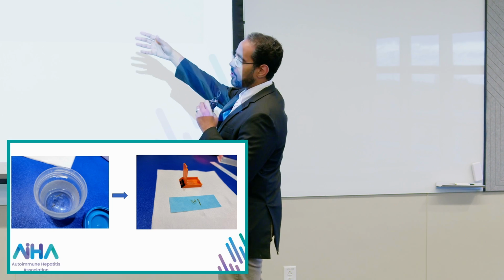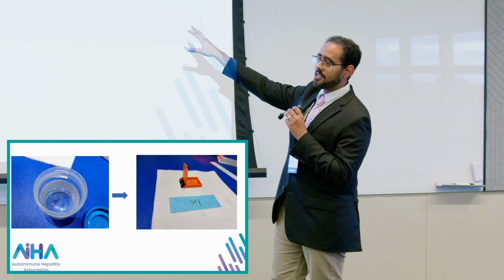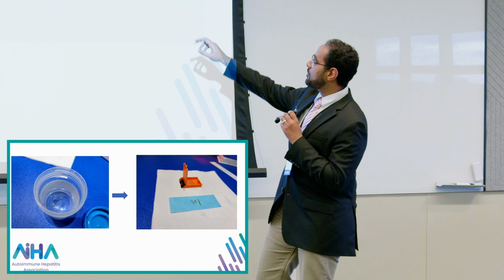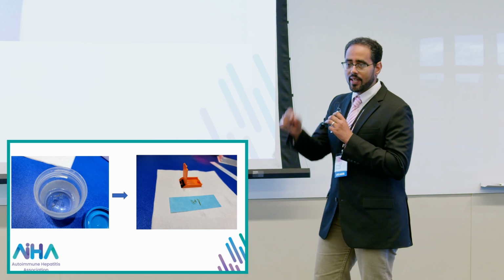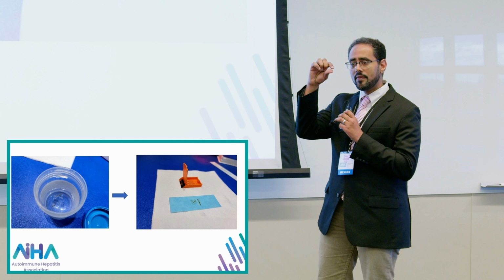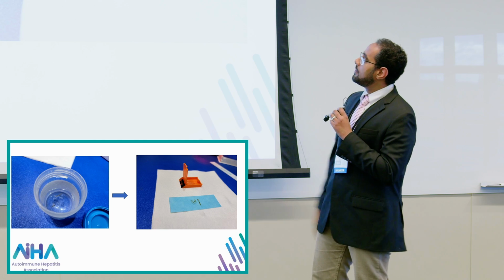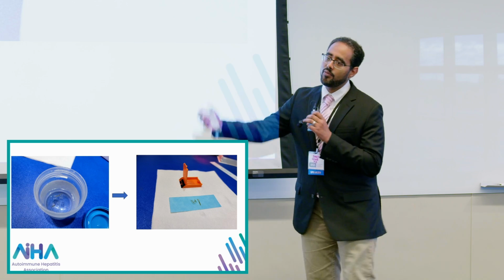This is what we call the gross room. I did not take a whole picture of the gross room, but this is where we process it. Someone there, a technologist, will take the biopsies out and put them on this paper. These are the liver biopsies, the core biopsies. They're very tiny, about 1 cm long, and very thin. They count them, describe them, and then transfer them into that orange plastic thing. It's called a cassette. And then we take that for processing.